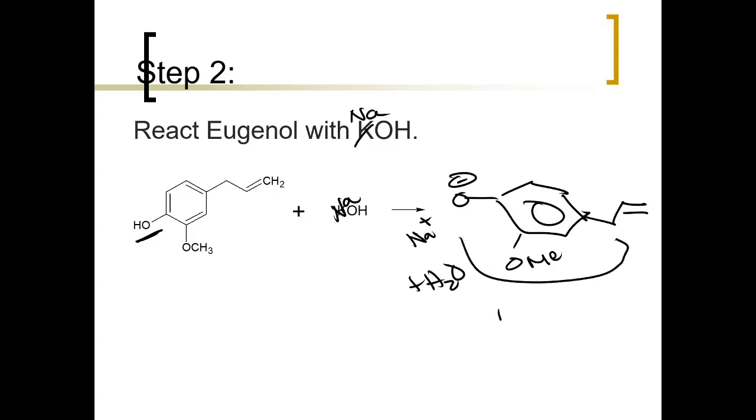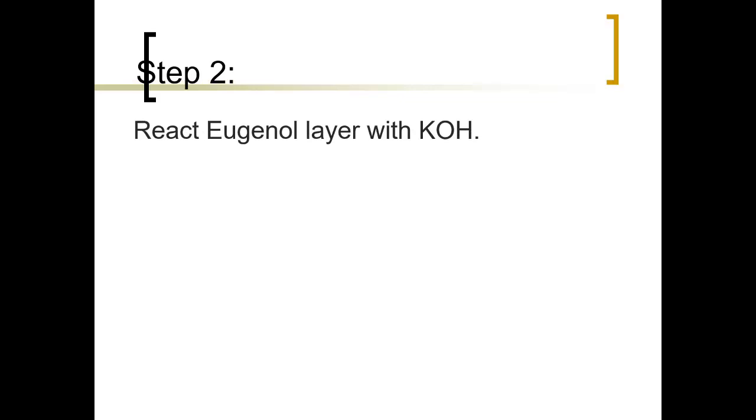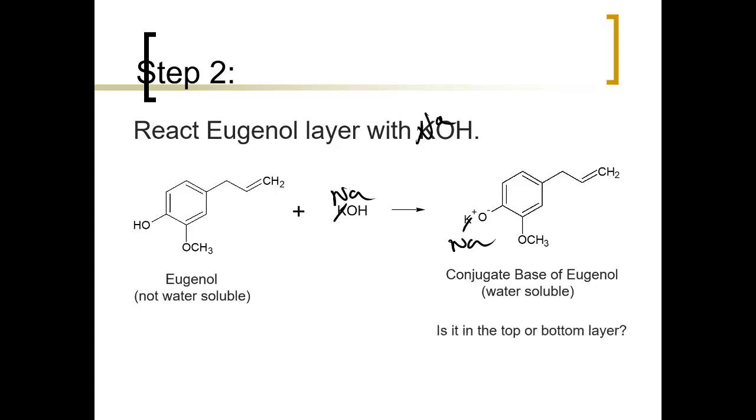So this is going to be more soluble in the water. And where is this water coming from? It's because you have 5% NaOH. The other 95%, that's water. So like I said before, I'm using sodium hydroxide in this case. Eugenol is not soluble in the water, but once you make it the conjugate base, it's soluble in the water. And so the question you have to ask yourself is, will it be in the top or the bottom layer? That's a question that you're going to be asked.